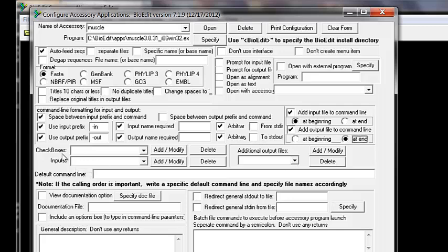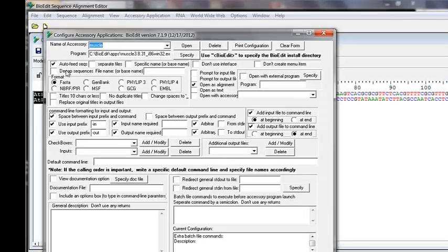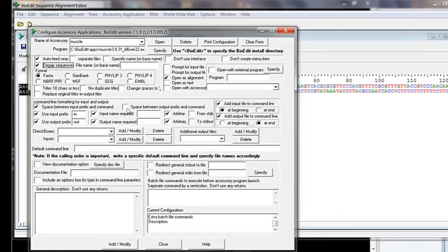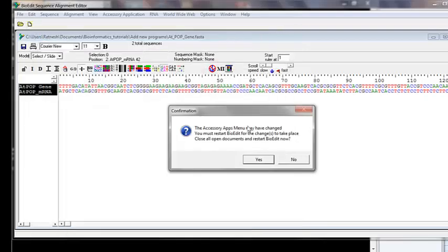The checkboxes section lets you give users extra parameter options — we'll come back to that. Also make sure to check 'add input file to command line at the beginning' and 'add output file to command line.' We also need to check the option to open the output as an alignment so we can see it inside BioEdit, and to de-gap sequences before feeding to the program.